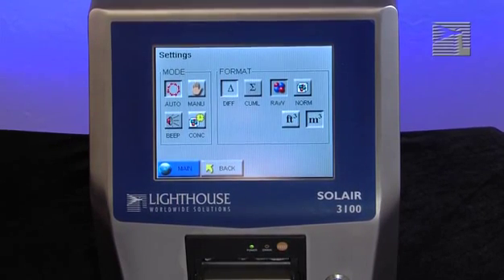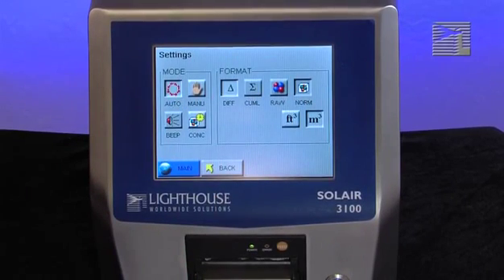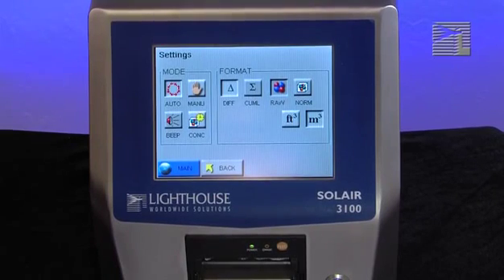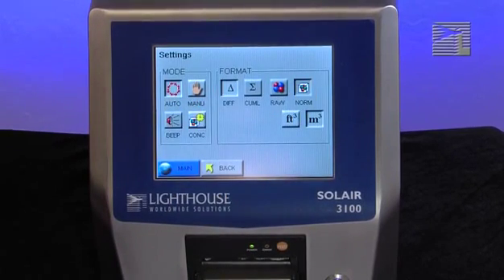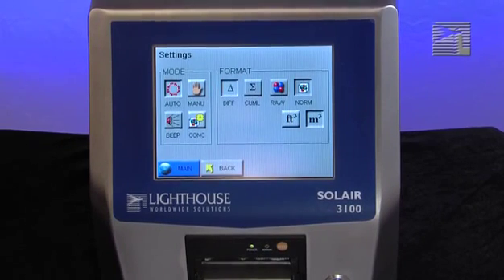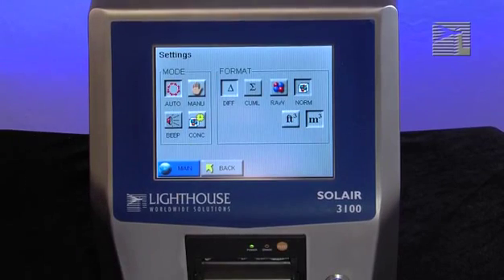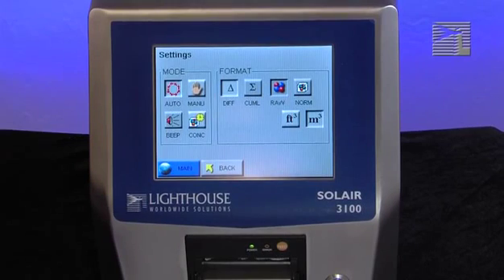The data format is either Raw or Normalized. Raw data displays the actual number of particles counted. Normalized data shows particle concentrations calculated from the raw data based on the settings chosen, either cubic feet or cubic meters. Select how you want the data to be displayed on the main screen and move to the next set of buttons.